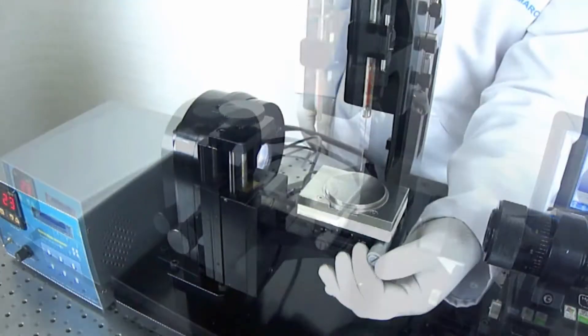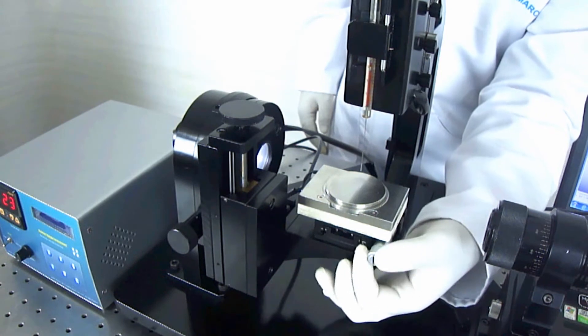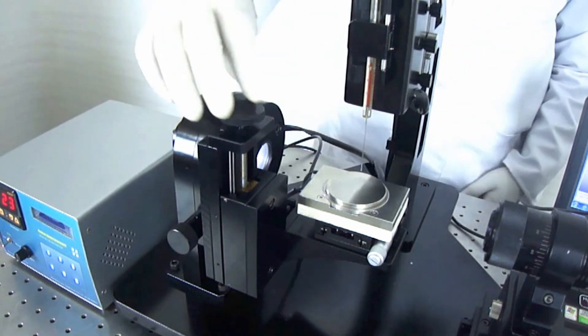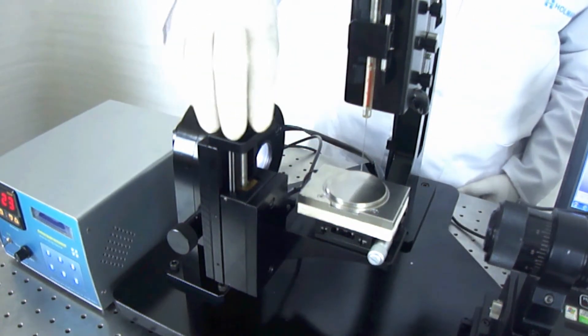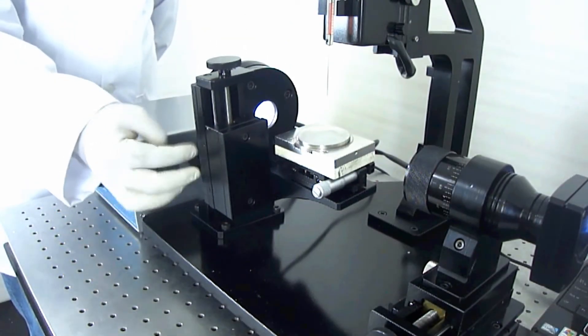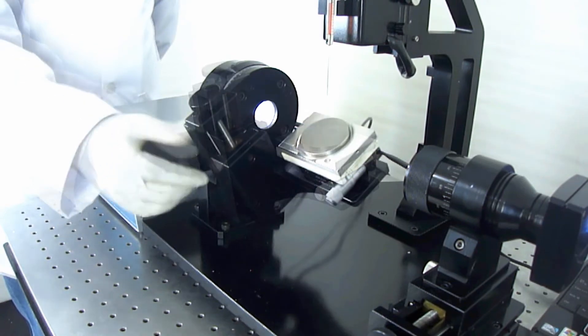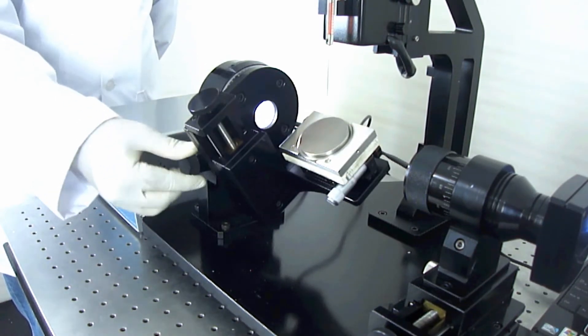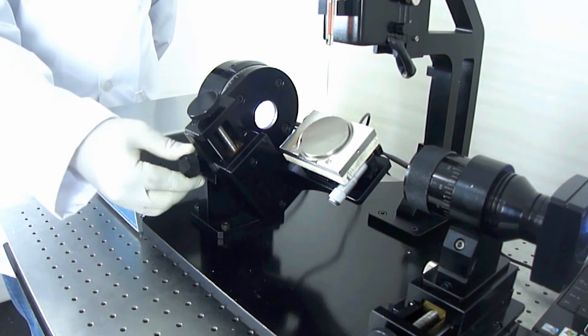The substrate bed with temperature control has horizontal and vertical adjustment features to keep the droplet in line with the camera and the LED backlight with intensity control. The bed can be rotated 360 degrees so that advanced contact angle study is possible.